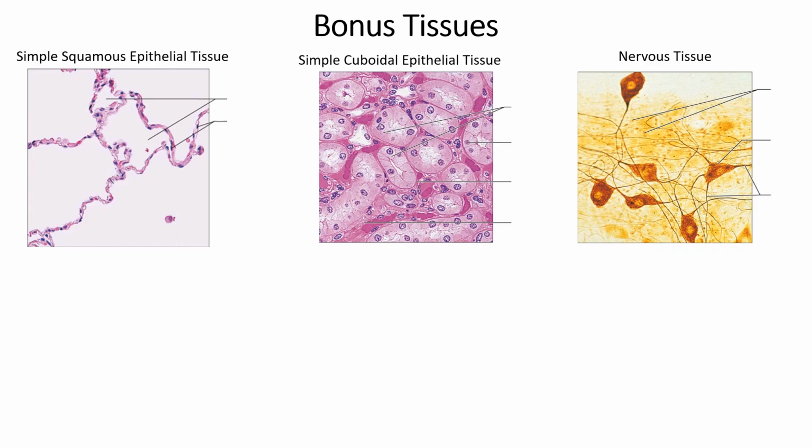And then a couple of epithelial tissues that we didn't talk about. So like simple squamous, simple meaning one row, squamous, your flattened cells. So this first image here would be what you would expect to see with a simple squamous epithelial tissue. And then the middle image here, simple cuboidal epithelial tissue. Notice that we clearly see circular structures that are made of cells, right? It's not like the circular structure of a lacuna, where it's just a circular structure with one cell inside.